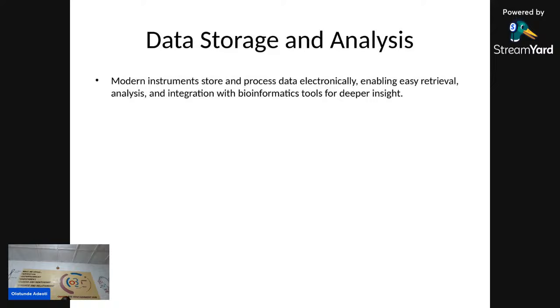In those days, everything was operated manually. You moved around with manual equipment, and most of what you did was not accurate and not so accessible to people. So modern instruments store and process data electronically, enabling easy retrieval, data analysis, and integration with bioinformatics tools for deeper insight.